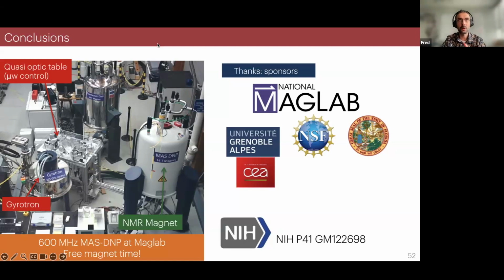The code will break down the moment we go to a very strong polarization regime, so when 1 minus P_E squared will not be negligible in the relaxation. So when you have really an asymmetry between the up and the down relaxation. Then in this non-linear case, I don't know. But for the rest, yeah, you can do simulations roughly between 30 to 200 Kelvin as long as I have the right parameters. It's just a tool. Thank you.